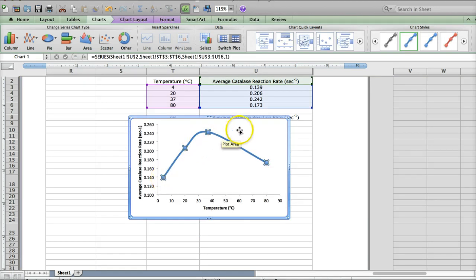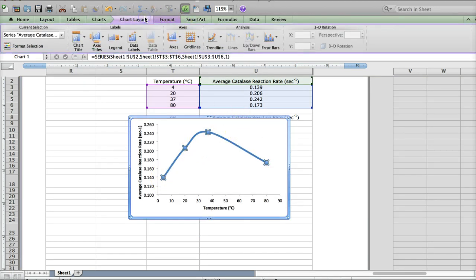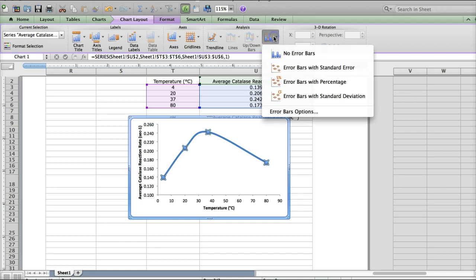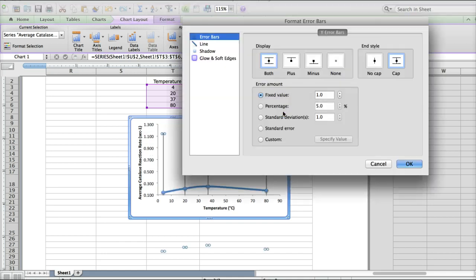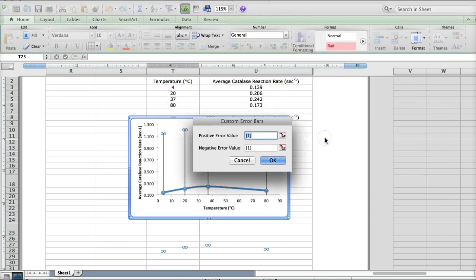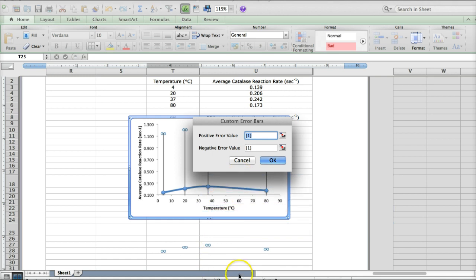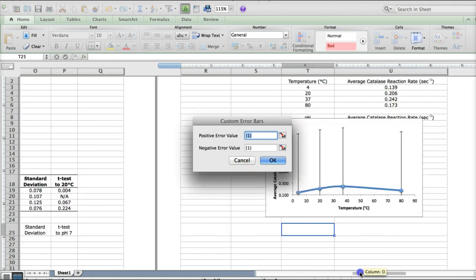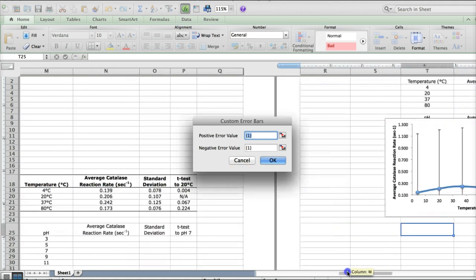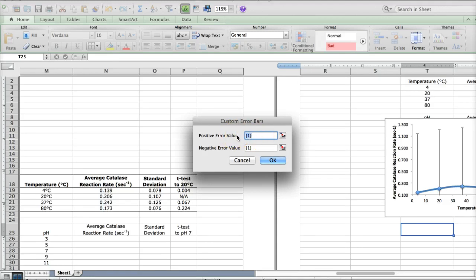And then, you'll go up here to the chart layout area again, but this time choose error bars. You want more error bar options. You're going to select custom and specify value, and it will give you this little custom error bars box. Then, you need to scroll over to your table here, and we want the standard deviation values to be represented by an arrow above the average and an arrow below the average.